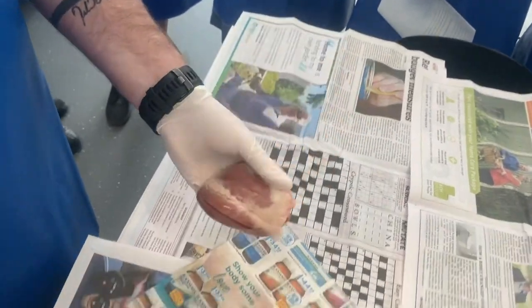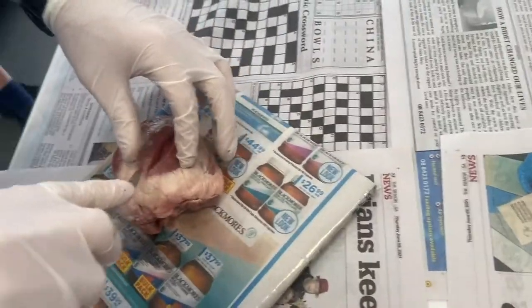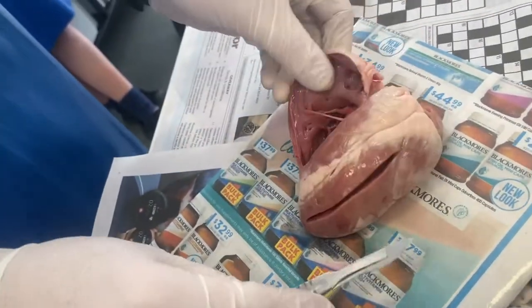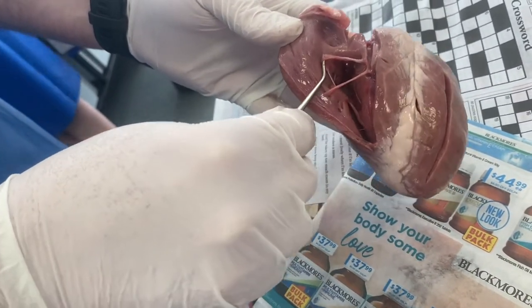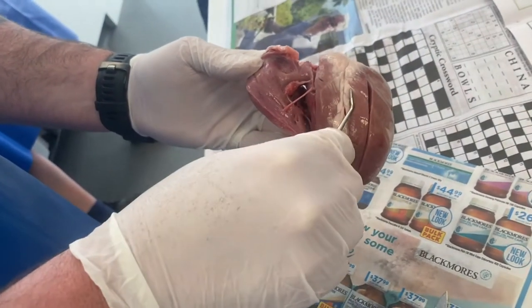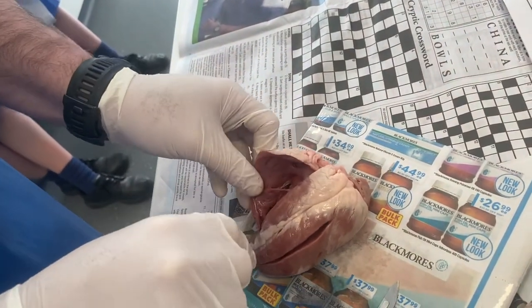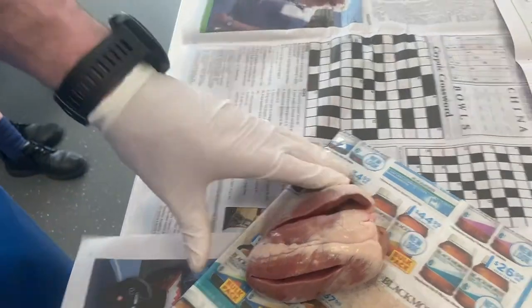Once you've had a look around, extend these cuts up nice and carefully to the top. This is where you start to open it up, and you'll begin to notice structures that look like parachute strings — those are actually the chordae tendineae, the strings connected to your valves. You've got these on both the left and right side, so open up both sides and have a look and a play with them. You may also find some little blood clots in there.